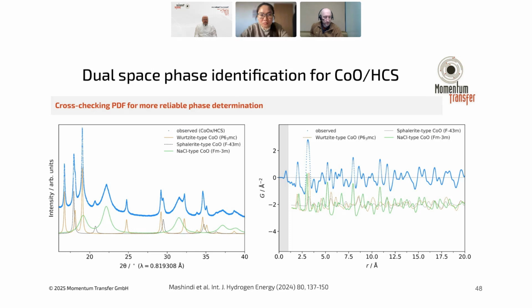And I do find a small, albeit more difficult to see by eye, peak around 2.5 angstroms. And actually in this case, we do also find metallic cobalt. I don't show it here, but we also find this, for instance, in XPS results. So we know it's there and we expect it. And that's something that you really just can't see in the diffraction pattern. There's no chance to realistically find that. And so that's already a nice bit of sensitivity that we have in the separation of the peaks at low distances.